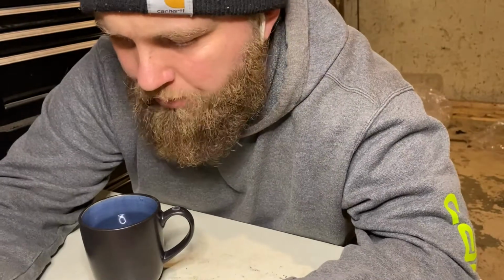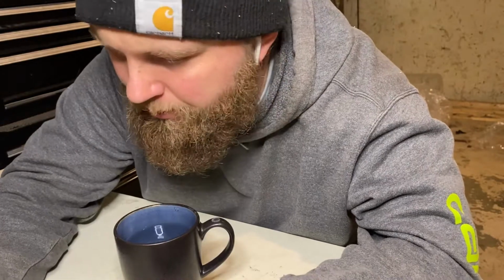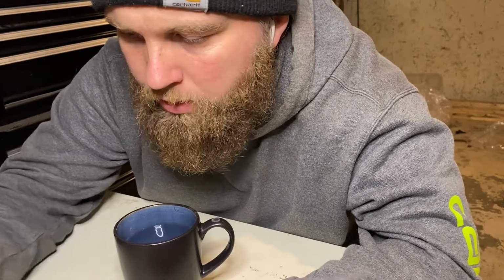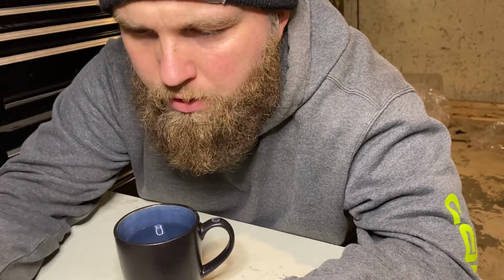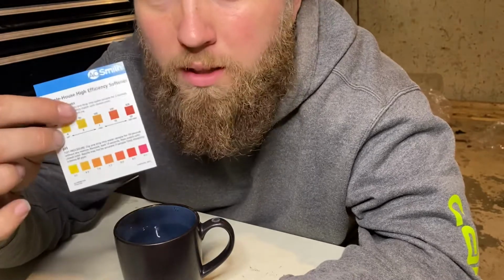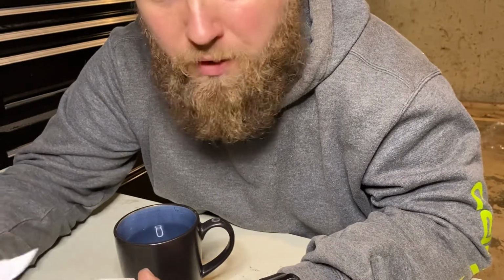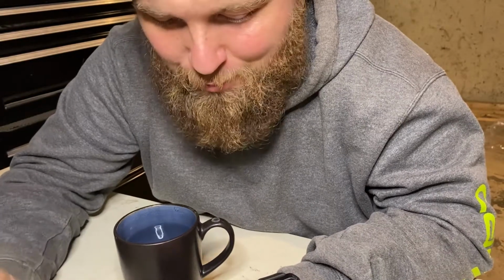I'm gonna go with hardness first. I have my cup of water here. Contrary to the belief that I would have had seeing this, it's not for me to drink. So I have the total hardness, and even cooler on here on the little card, they gave you the instructions. So I'm testing hardness. Hardness is the top one on the list. So what I'm gonna do, double check the instructions, because I've never done this myself other than with my mom shouting instructions over my shoulder for the pool.